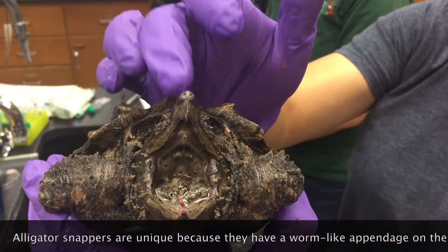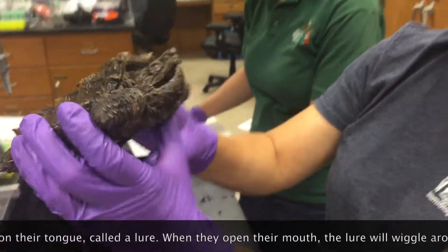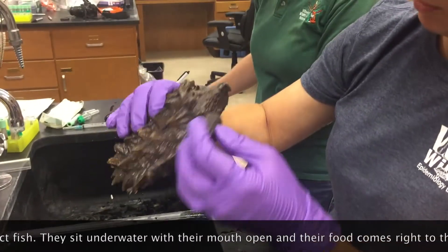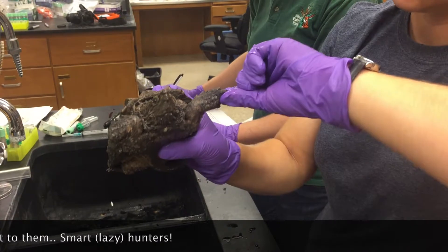That pink thing is a lure they use to catch prey items — they wiggle it around to make it look like a worm. And we're going to look at the front feet. Make sure they've got all the toes, no wounds, lumps, bumps, or anything like that. Those look pretty normal.